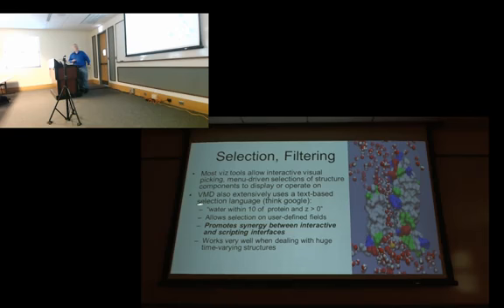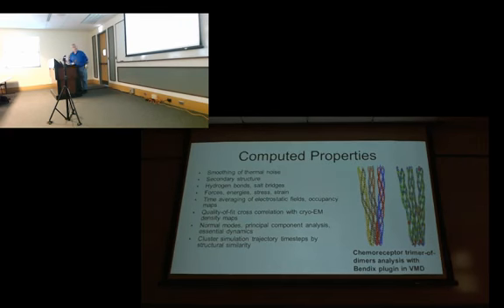And so this gives you a sort of synergistic feature between the visualization and analytical and structure building attributes of the program. And this is particularly useful when you're dealing with time-varying structures, structures that are so large it would take you the rest of a week to go picking things by hand with a mouse. You'd commit suicide long before you finish clicking on all those atoms.